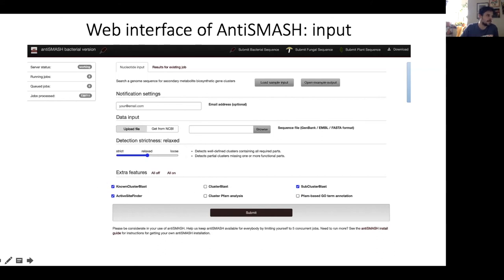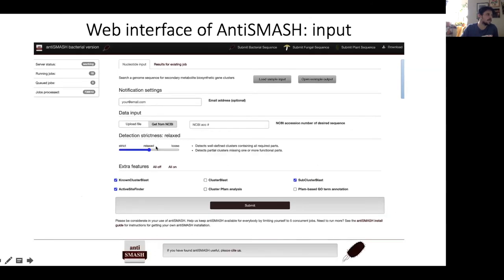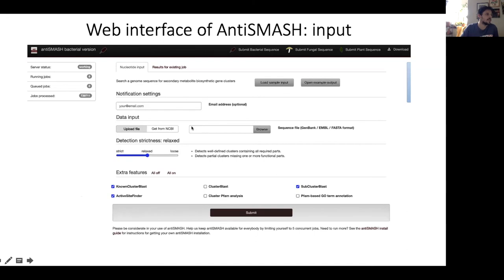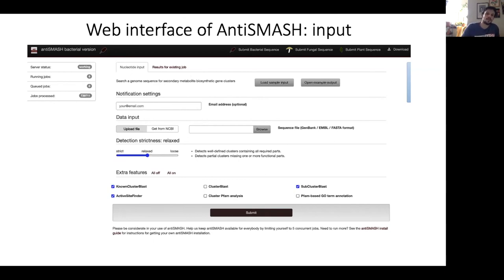You can also turn extra features on or off, such as ActiveSiteFinder and ClusterBlast. These will significantly increase the runtime of antiSMASH but will give you more output. Once you upload the file or provide an NCBI accession number, you click Submit. If you don't provide your email, it takes you to a page that reloads every 10 to 20 seconds — similar to how NCBI BLAST works — until the results are done.